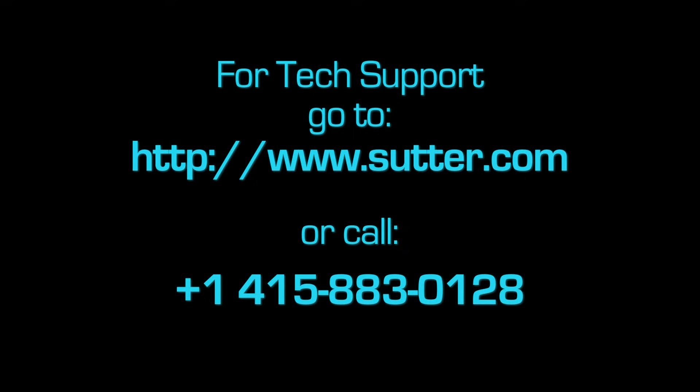This video is meant as a diagnostic tool. Please contact SUTTER Tech support for further guidance before making any adjustments or attempting repairs.